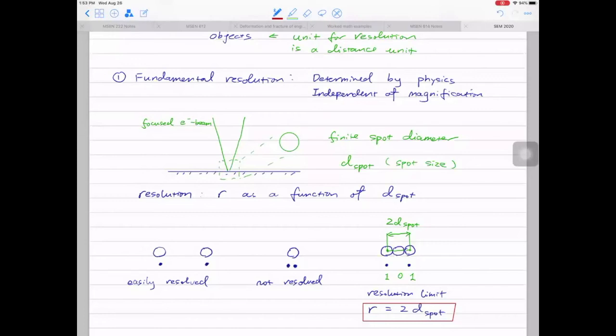If the resolution of the instrument is 10 nanometers, you know that you cannot resolve something 5 nanometers in size. If you have nanoparticles 5 nanometers in size, and your resolution is 10 nanometers, it's not even worth trying. You know you need to either play with the beam, or you need to find a better instrument. This tells you whether it's worth the effort to do the studies by knowing the resolution.